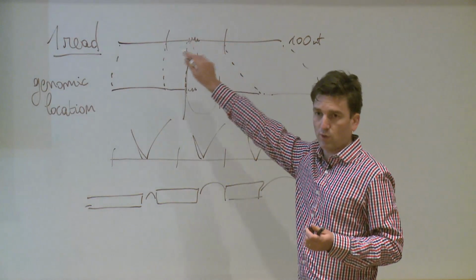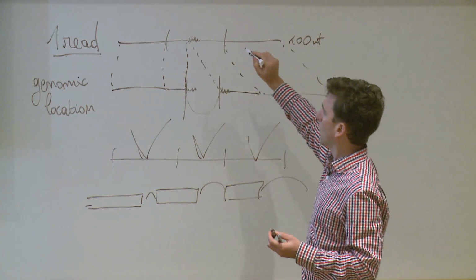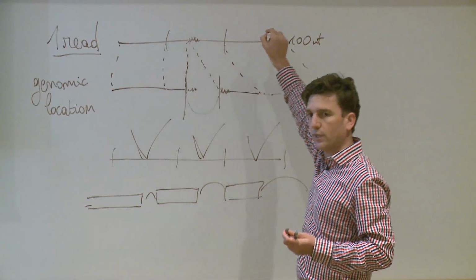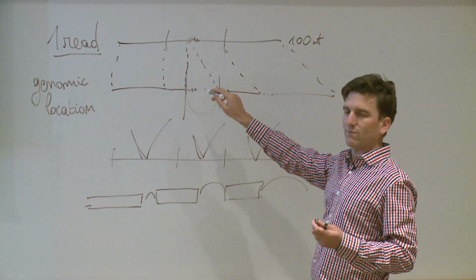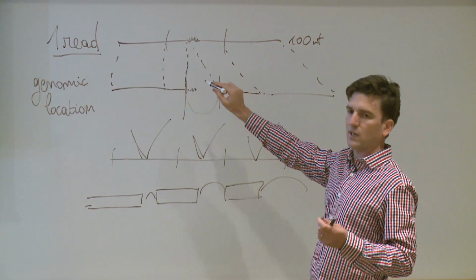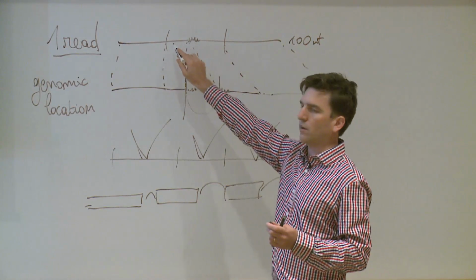Here I describe it with 3 pieces. You can actually do it with more than that, right? And so what it would do is split in 3. If it finds 2 locations that are fairly close, say less than 10 kb apart, then that's a good alignment, and it will try its best to find where this maps.